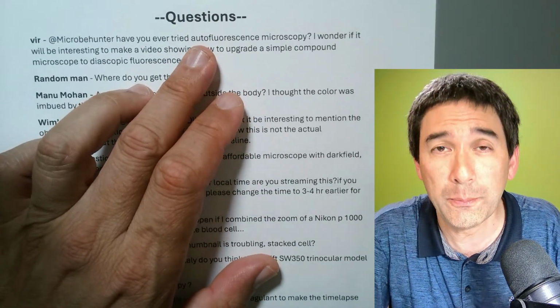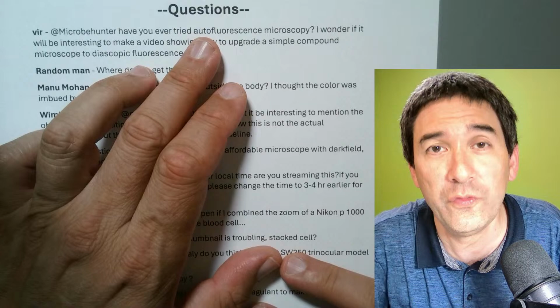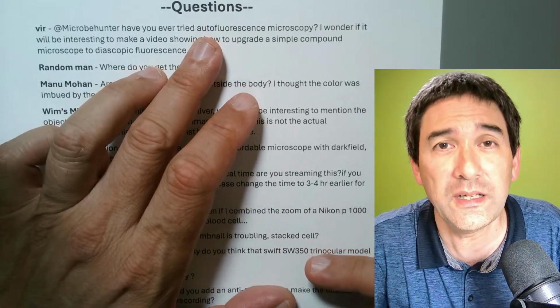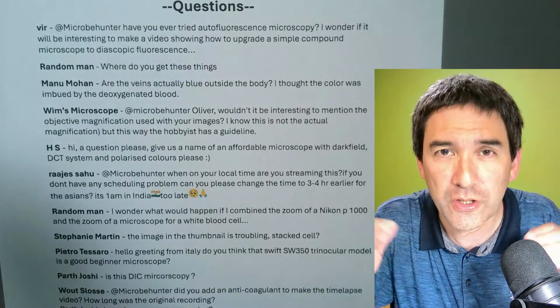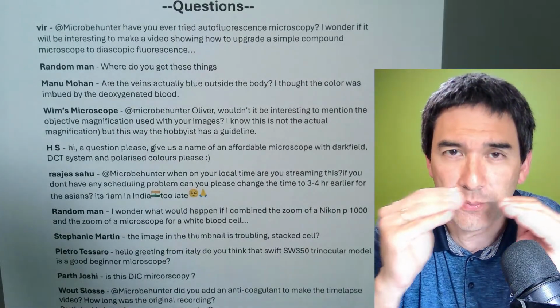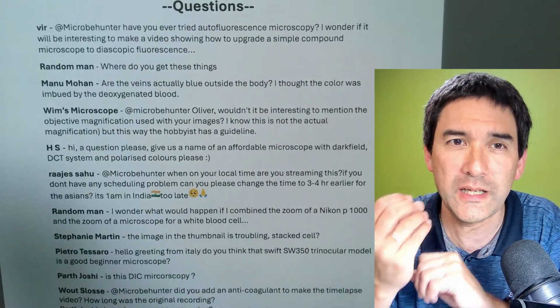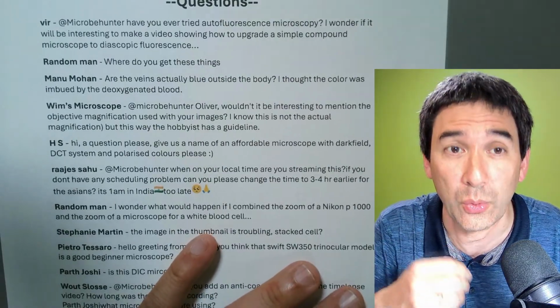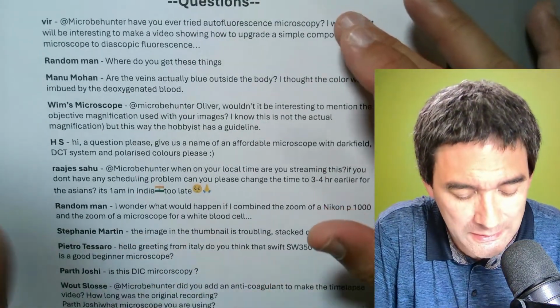I've tried to upgrade a microscope also using UV or blue light LEDs. When you do that, then you need a dark field patch stop to make sure that the blue light or the UV light only shines from the side. And then you might be lucky that you're able to see some of the cells actually start to glow. Yes, I've had a little bit limited success.